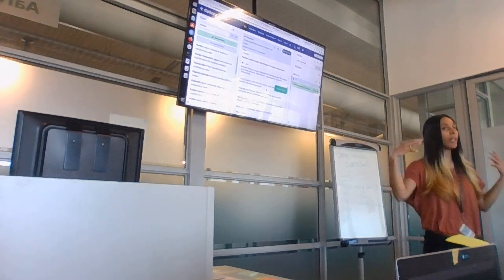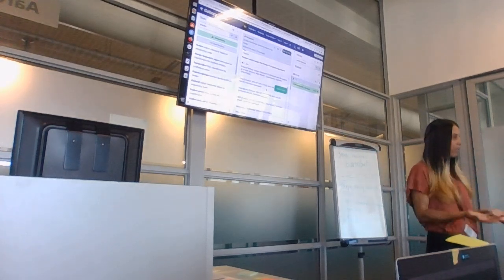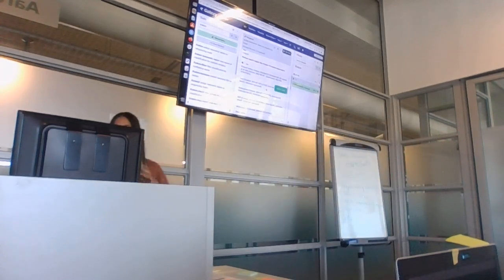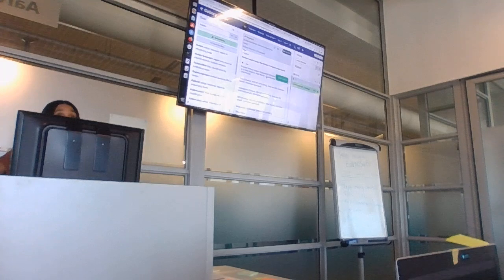But if you don't know, you choose everything because you don't know. So the standard one is kind of everything. This one, RefSeq, as far as I've read, has additional ones. It ran on this 5.8 megabyte thing for probably 5 hours or something. That's why I say don't submit it. But your result will come out like this.